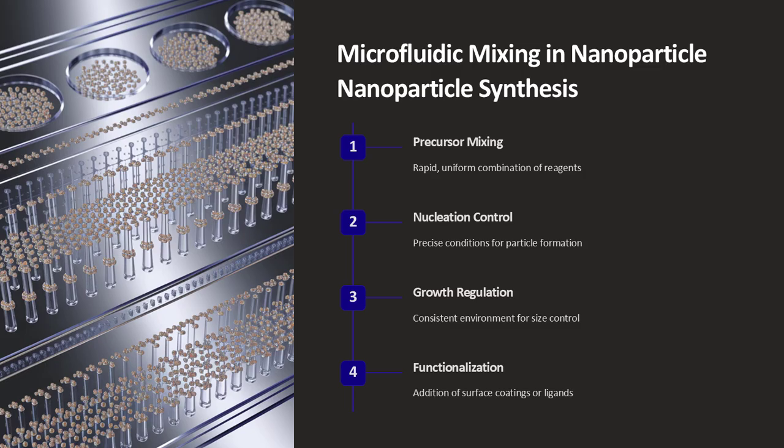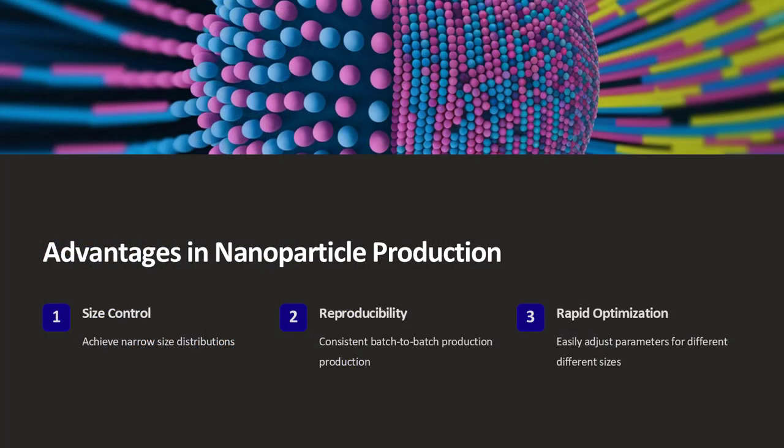In contrast, the high-powered blender, much like a microfluidic mixer, rapidly and uniformly mixes the contents, ensuring that every bite of the puree is consistent. This analogy captures the essence of why microfluidic mixing techniques are so valuable. They enable a level of homogeneity and control that is simply not possible in larger-scale systems.